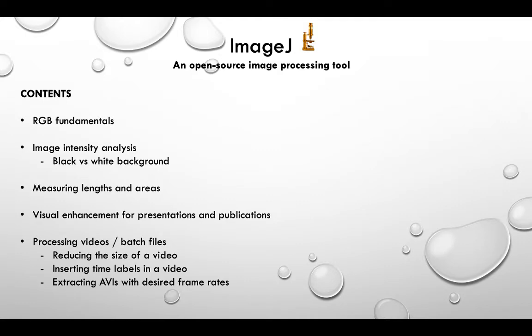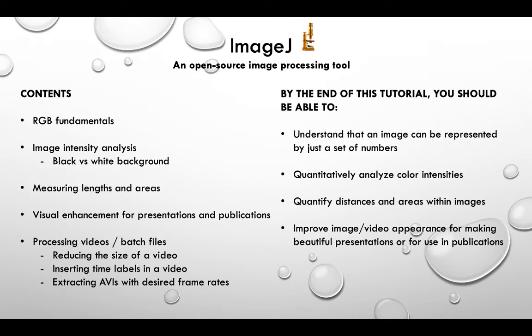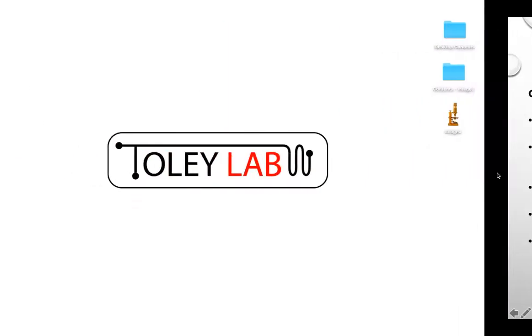So, in parallel to the contents, by the end of this tutorial, what you should be able to do is to understand that an image basically can be represented by just a set of numbers. At the end of the day, it is just a set of numbers that you can quantitatively analyze. You should be able to, at the end of this video, quantitatively analyze color intensities within any image given to you, quantify distances and areas, and improve image or video qualities or appearance for making beautiful presentations or for use in publications. So let's get started.